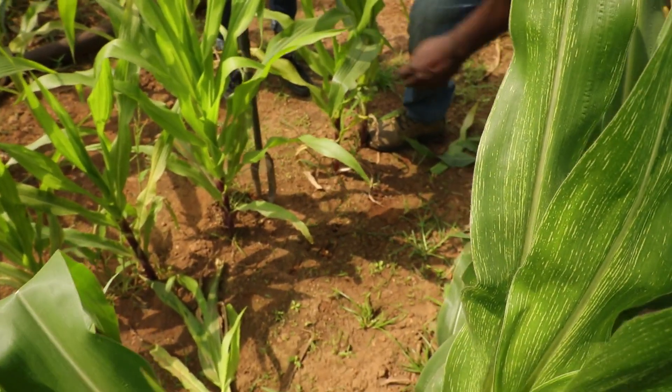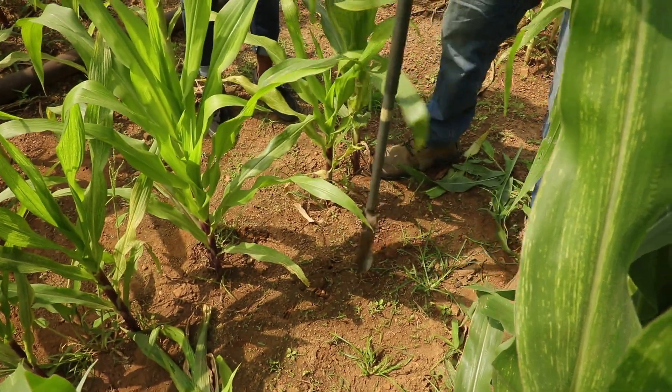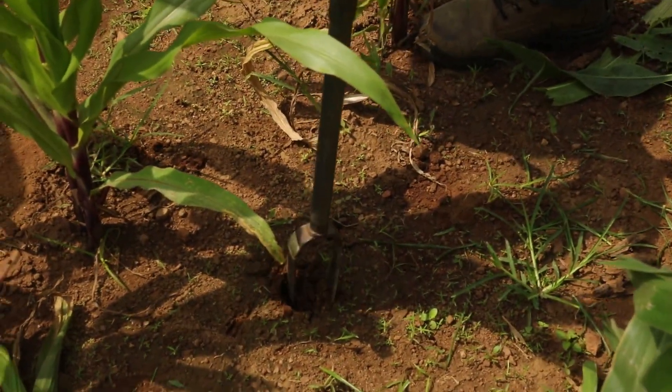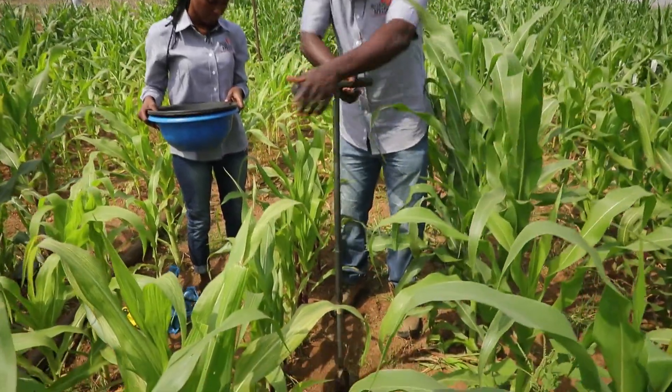Collect the topsoil sample from the point. Put the auger straight down and turn it vertically downward. Be straight — keep it from slanting and going sideways.